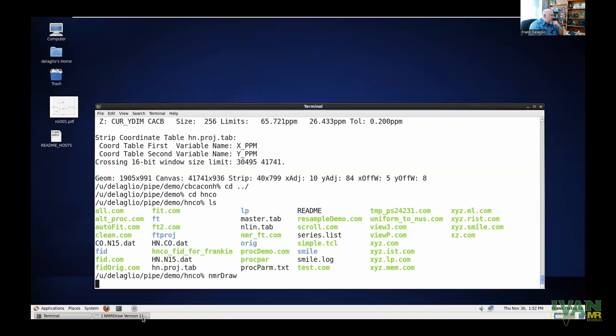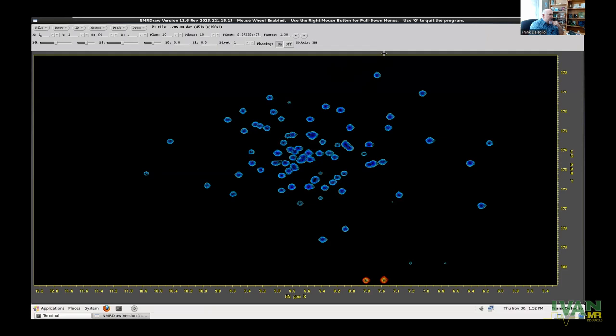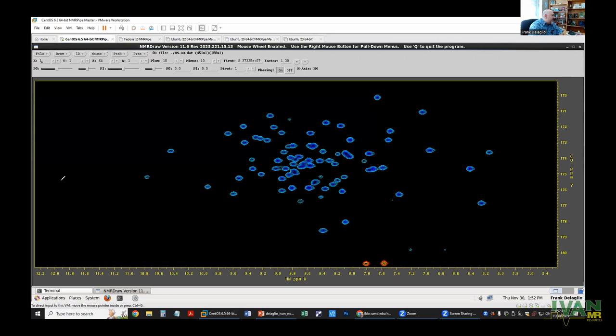here's a spectrum that we looked at before. And these two peaks are folded from the other side, so they're negative, all right? But let me see, I should be able to annotate, right? Okay, so we have two folded peaks here, and we can tell they're folded because they're negative. This dimension has 180 degree first order phase correction, which means every time a peak folds from one edge to the other, its phase gets incremented by 180. Now, we could also have unfolded peaks that are right here at the same position as these folded peaks. Okay, so there's pretty much no way to treat the spectrum and do something with these peaks, which are folded, that wouldn't also change these peaks, which are not folded.